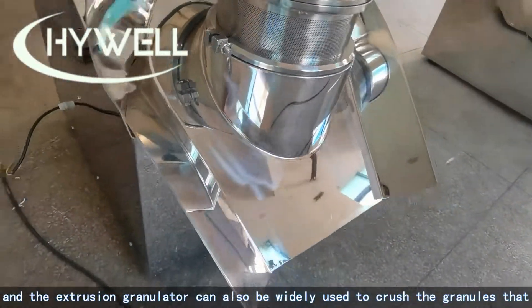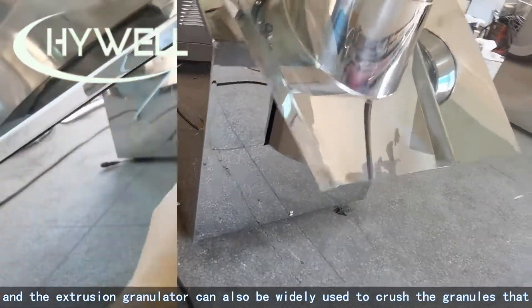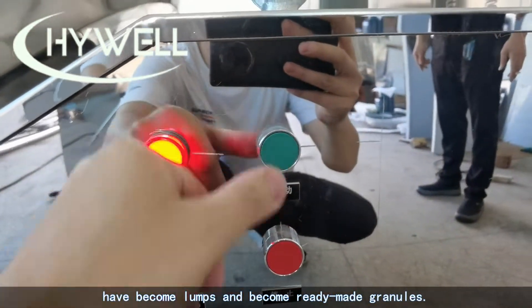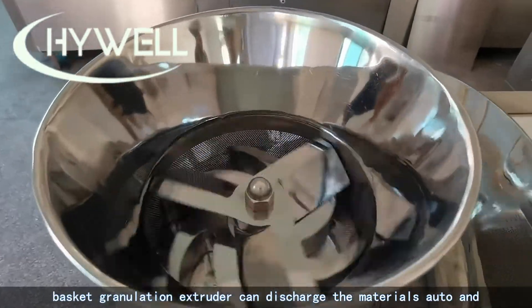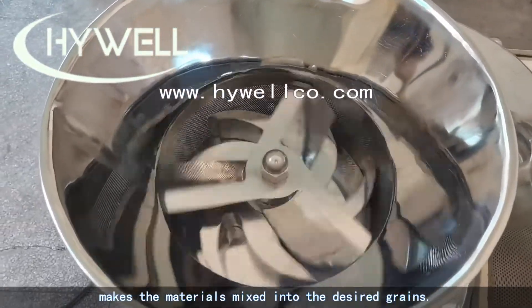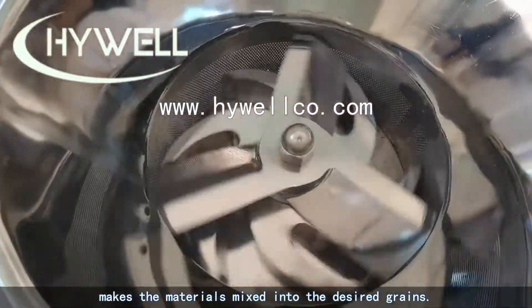And the extrusion granulator can also be widely used to crush granules that have become lumps back into ready-made granules. The basket granulation extruder can automatically discharge materials and mix them into the desired grain size.